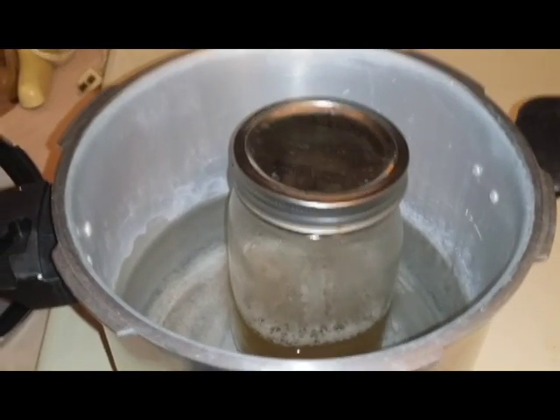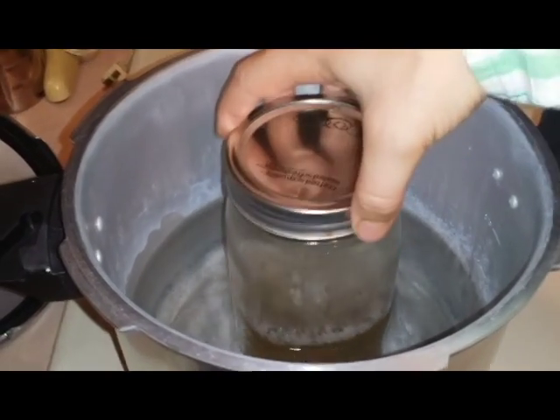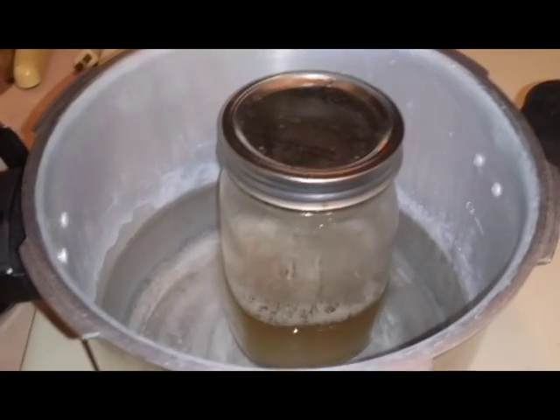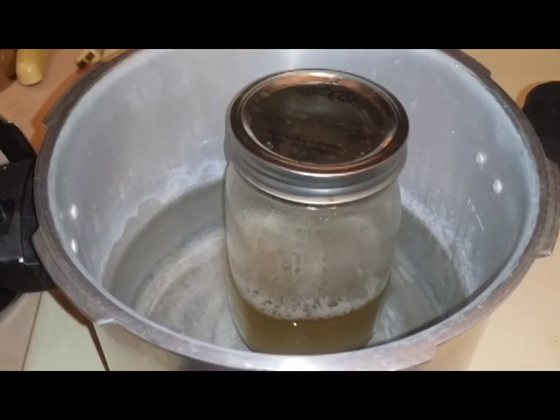Here is our autoclave. You can see I've got some media I'd like to sterilize in there. I've capped it loosely enough so that I can lift it up by the cap, but also loose enough that it'll off-gas and it won't explode in your pressure cooker.